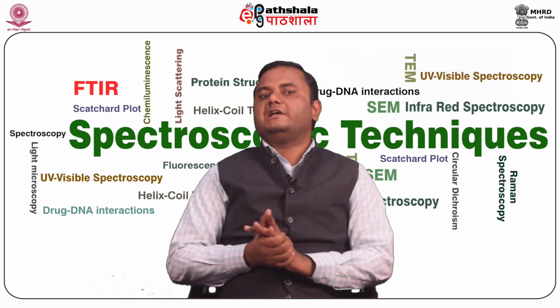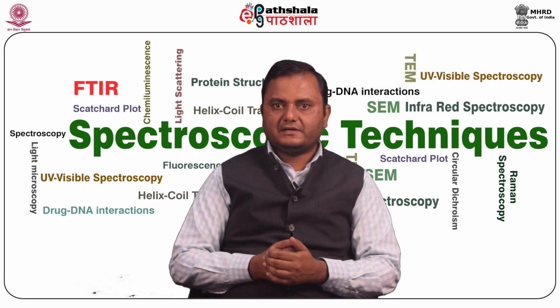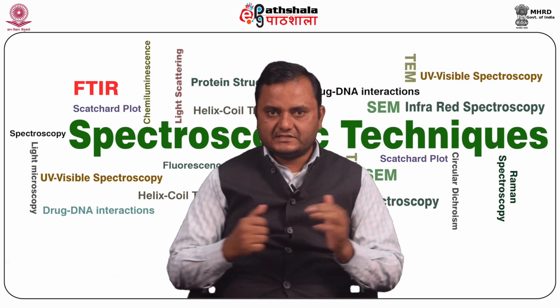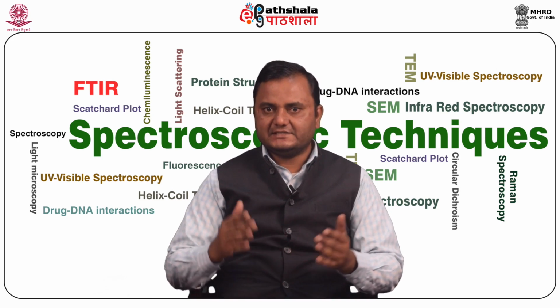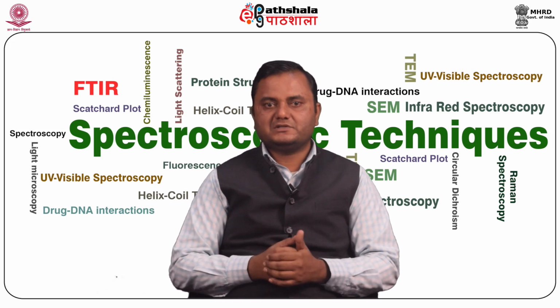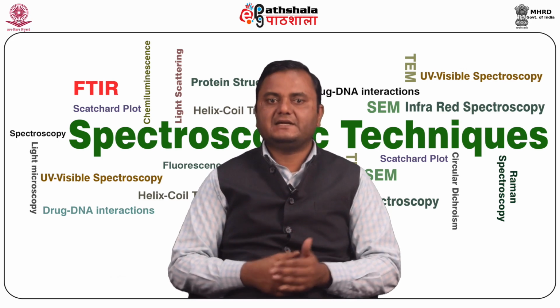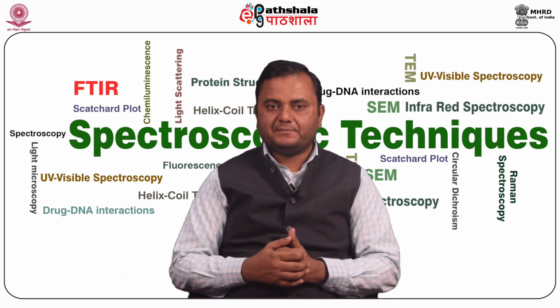Now we talk about the FTIR detectors. The two most popular detectors for FTIR spectrometers: one is deuterated triglycine sulfate, named DTGS. It is a pyroelectric detector that delivers rapid response because it measures the change in temperature rather than the value of temperature. It operates at room temperature.